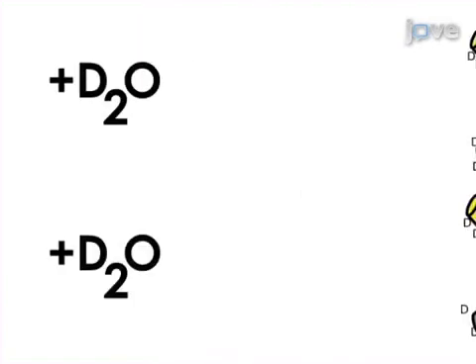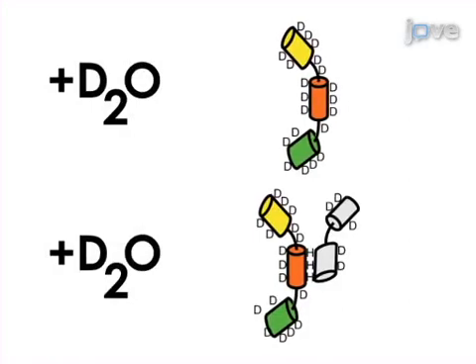The reaction mixture is then diluted into deuterium oxide, incubated for different time intervals, and subsequently analyzed by liquid chromatography mass spectrometry to determine the degree of deuteron incorporation into the peptide backbone amide groups.